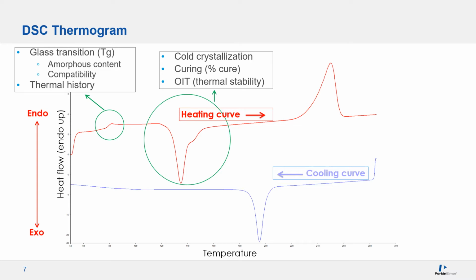This adds to the degree of crystallinity, so its enthalpy change has to be subtracted from the melting peak later to calculate the degree of crystallinity as received. The cold crystallization can also overlap with the Tg to make the Tg hard to measure. This type of crystallization is different from the common crystallization from hot melt state, so it is termed cold crystallization. Other possible causes of an exothermic transition in this range above Tg can be curing reactions and oxidation.